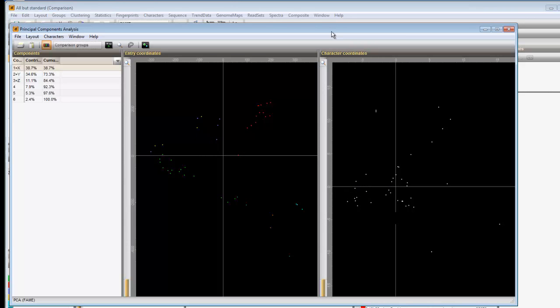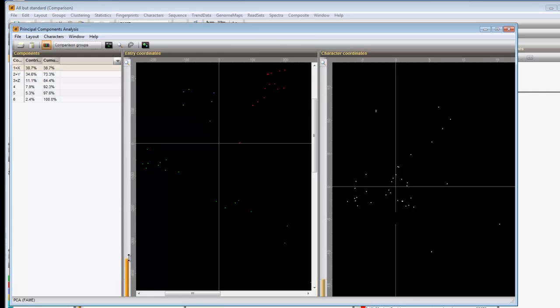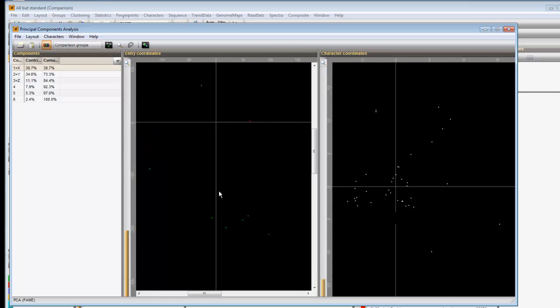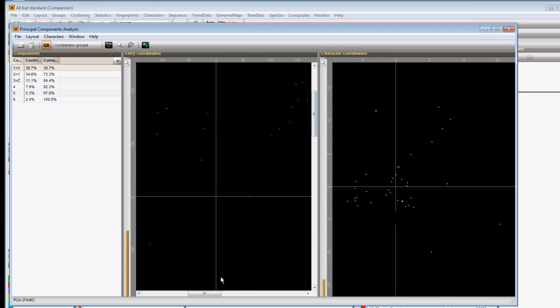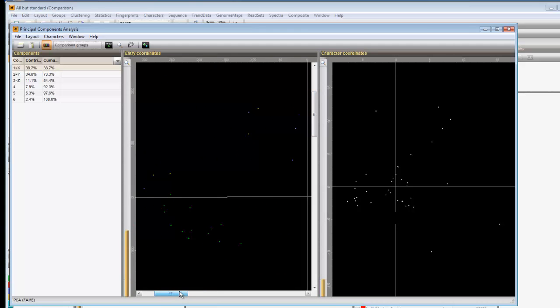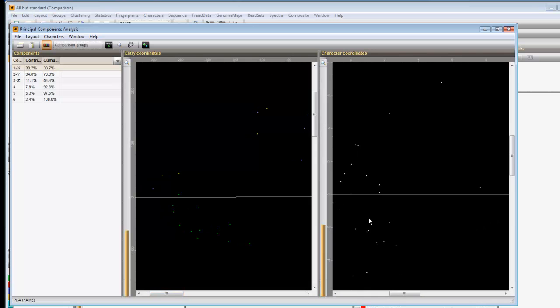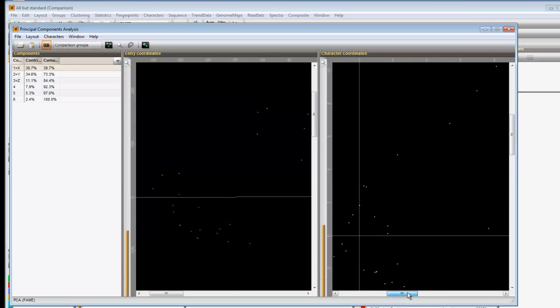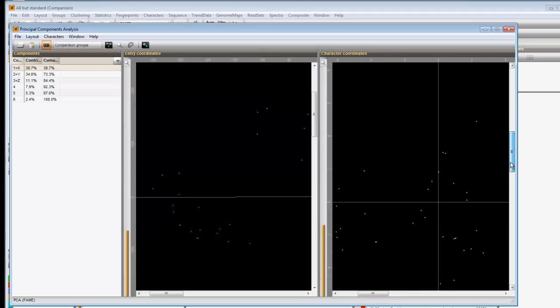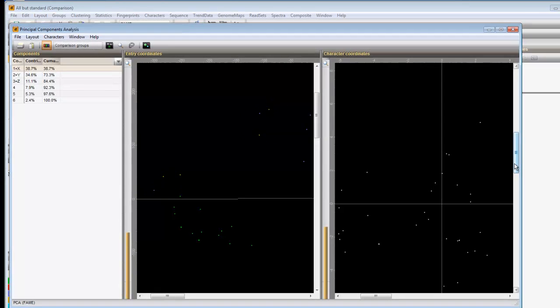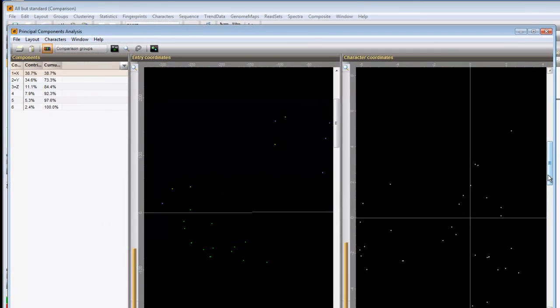The zoom sliders can help to visualize a particular area of the plot. If you move the mouse pointer over the character coordinates panel, the name of the pointed character is shown.